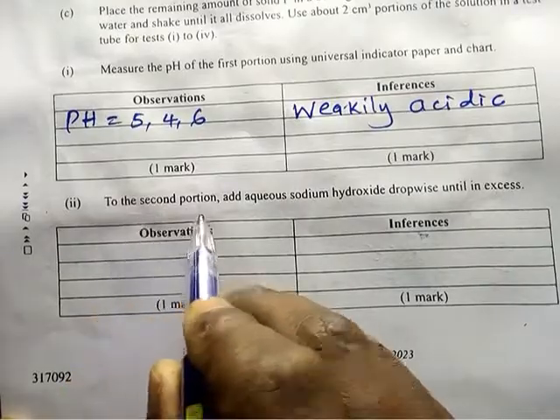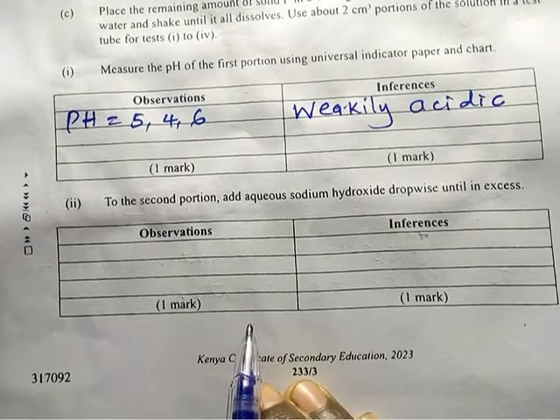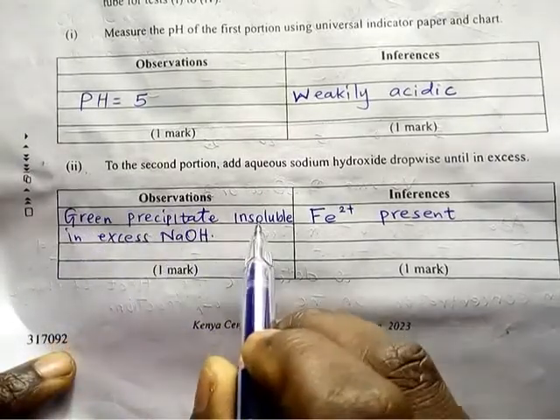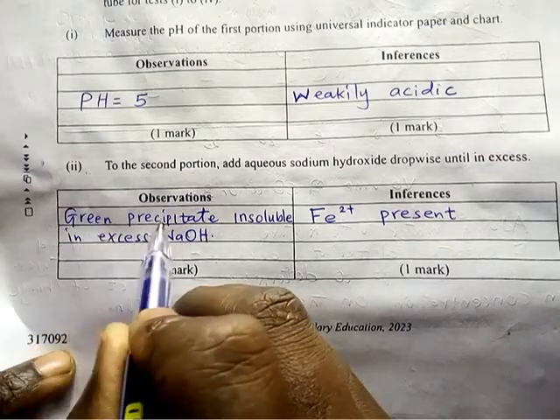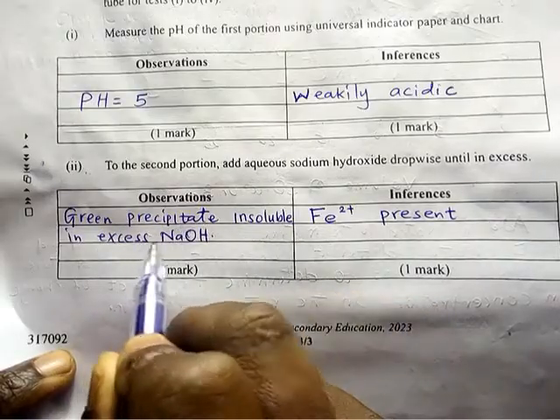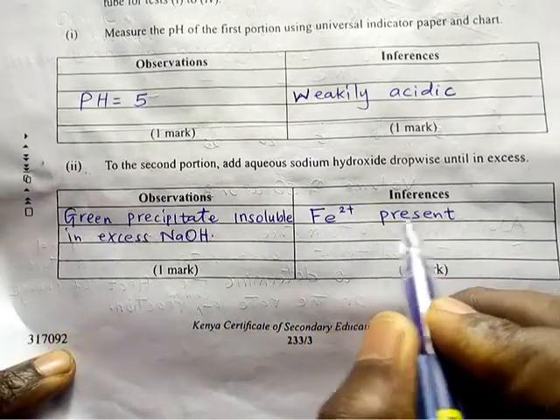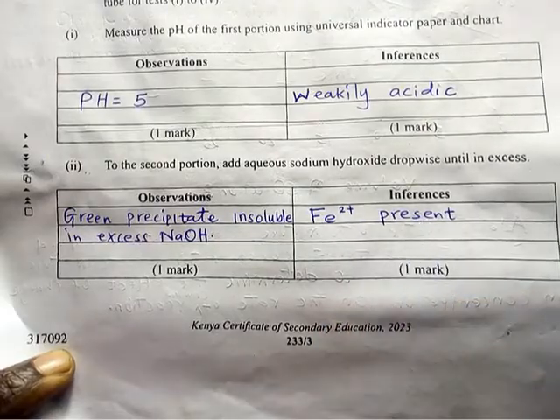To the second portion, add aqueous sodium hydroxide dropwise until in excess. What happened is that a green precipitate was formed, which is insoluble in excess. Green precipitate insoluble in excess. That confirms that if you have green, then iron(II) ions are present. Iron(II) ions are present. That's nice.